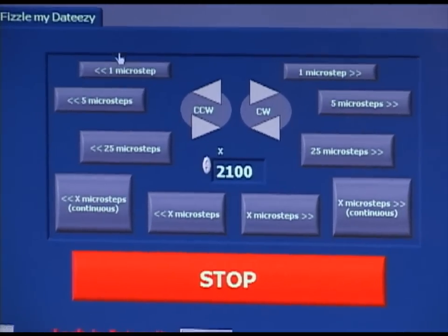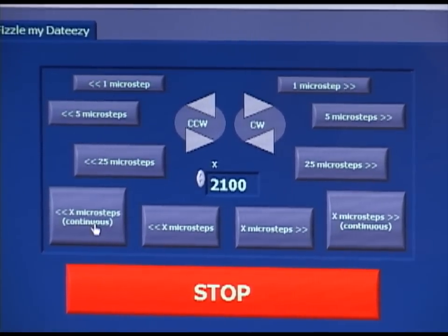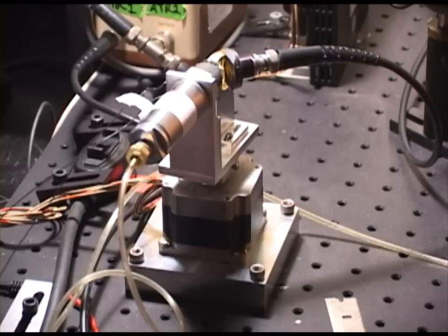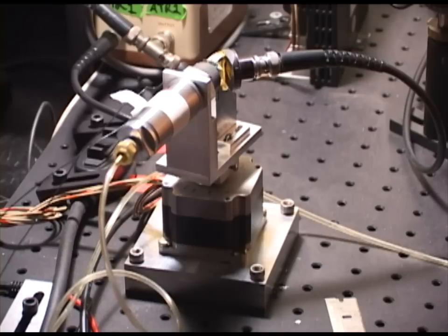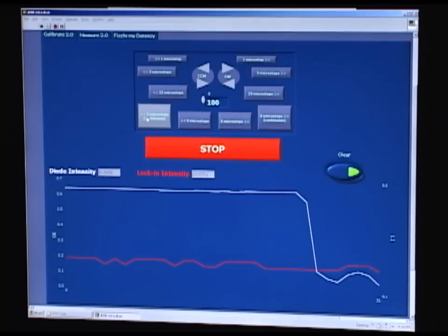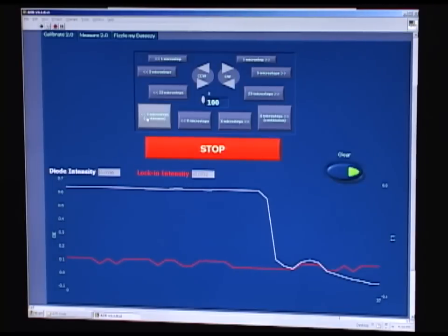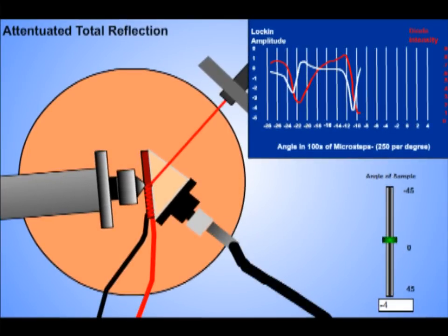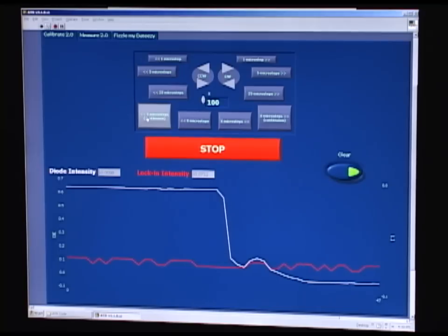I do this by clicking any one of these motor control buttons. The lower buttons move continuously or in large steps for scanning across large areas and the upper buttons move in small steps to fine tune. The computer controls the motor which will then slowly rotate the stage in micro steps. During the calibration process, we'll scan across a full range of angles on the sample, searching for modes that occur at critical angles. At these modes, there is total internal reflection inside the chromophore and polymer host film. These modes will be represented by a sharp dip in diode intensity and a simultaneous sharp dip in lock-in intensity.